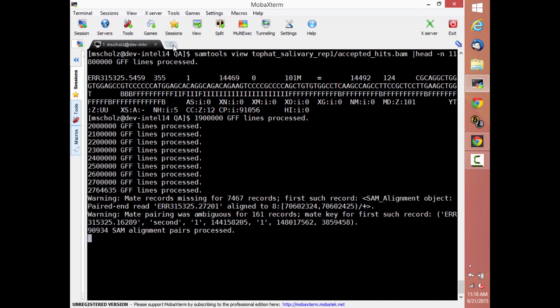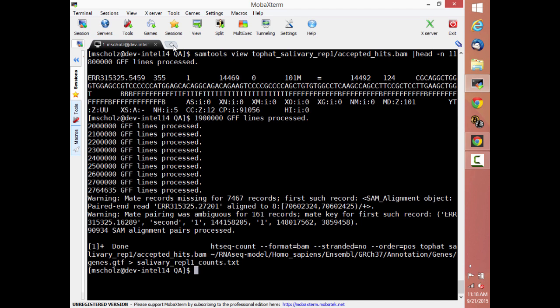The reason why I'm choosing this pathway is because about a year ago, Titus put out a call to our friends on Twitter and said, which tool do you think is the best tool, which pipeline do you think is the best one to use for RNA-seq analysis? And the general consensus was to use TopHat into HTSeq into edgeR. That is based entirely on recommendations of other people who are not you. If you don't like this pipeline, you are welcome to use a different one. They will give you slightly different results.